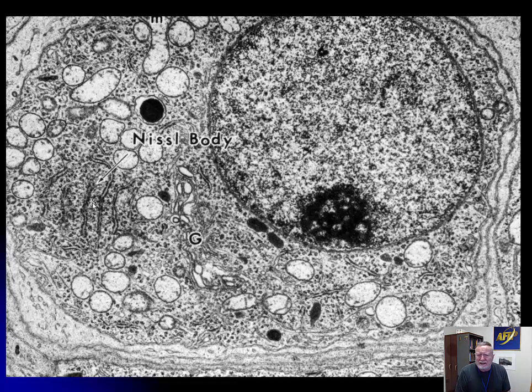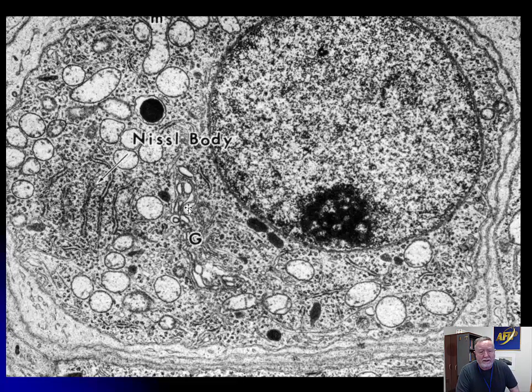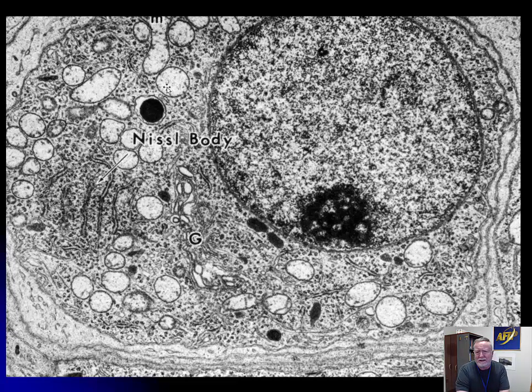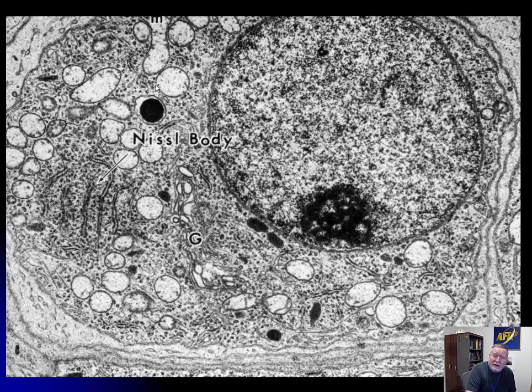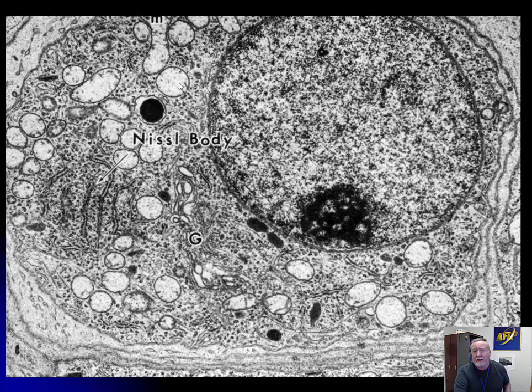There is some rough endoplasmic reticulum, but neurons don't secrete a lot of protein, aside from neurotransmitters. There is a fairly large Golgi apparatus because these cells are big and need it as the post office of the cell — glycosylating and addressing proteins so they know where to go. One interesting observation is that despite neurons needing oxygen desperately, the mitochondria tend not to have a lot of cristae. These mitochondria are set to produce lower amounts of ATP, potentially through anaerobic glycolysis.